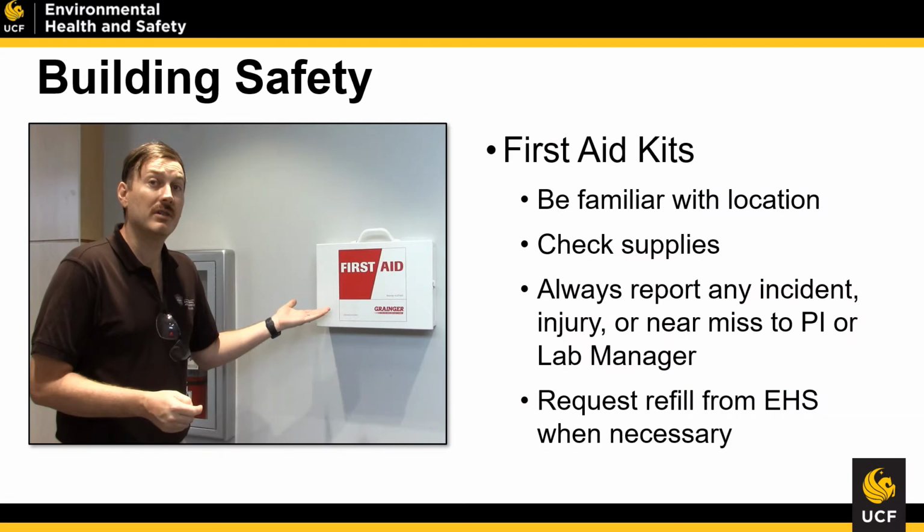Wherever there is a laboratory hazard, first aid equipment will be available for your use. Typically, that first aid equipment is found in a common space or within your lab. Please always check to make sure first aid equipment is easily accessible and that you know what is available within your first aid kit. First aid kits are maintained by the Environmental Health and Safety Department, so if you need refills, please put in a request to us.